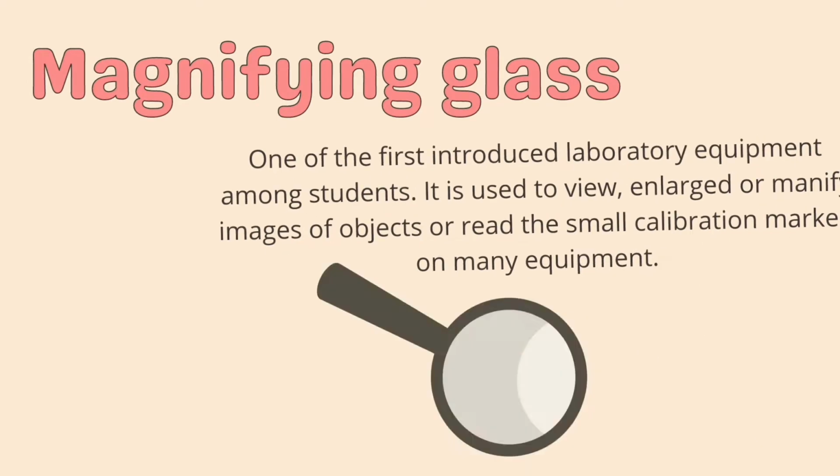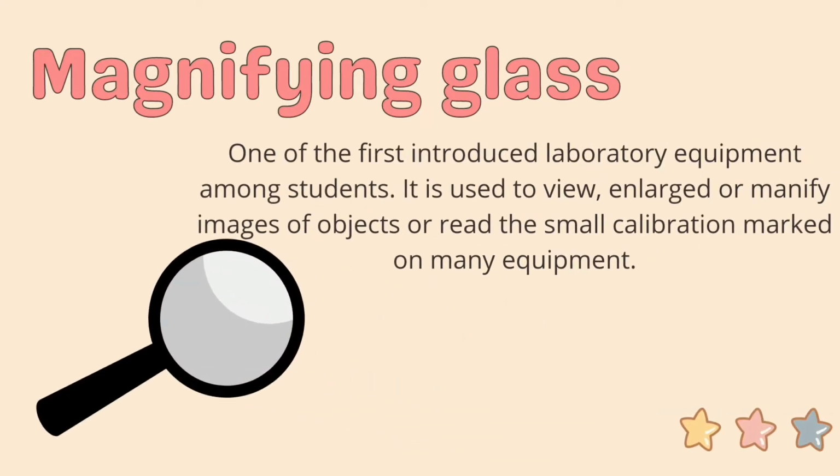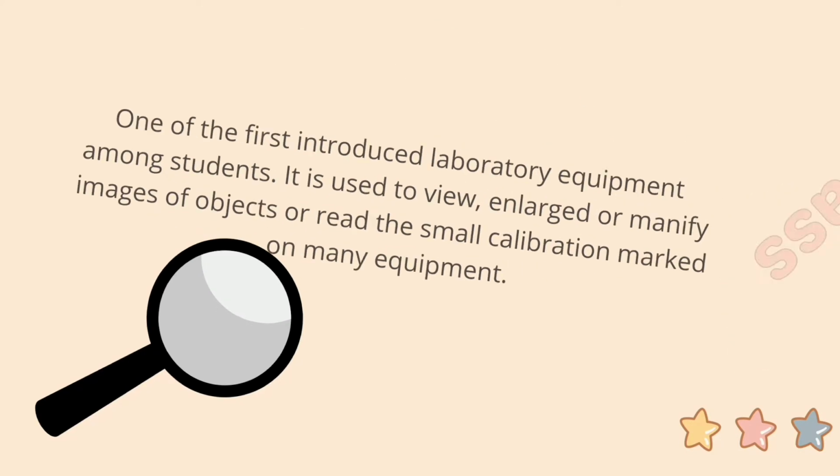One of the first introduced laboratory equipment among students is the magnifying glass. It is used to view enlarged or magnified images of objects or read the small calibrations marked on many equipments.